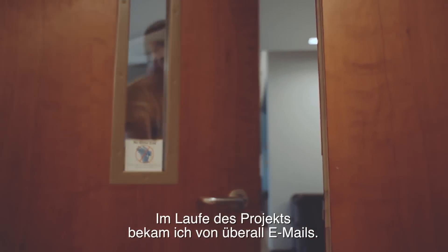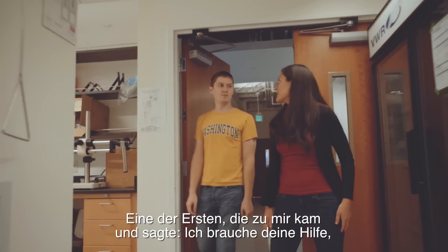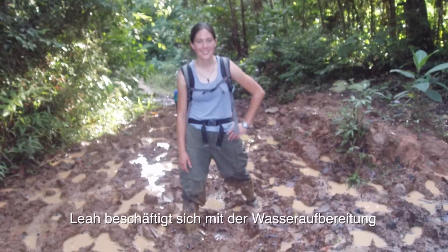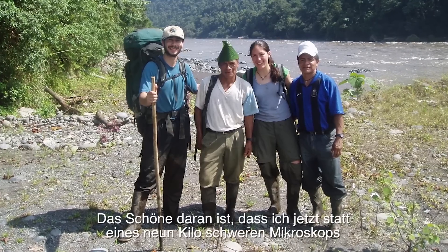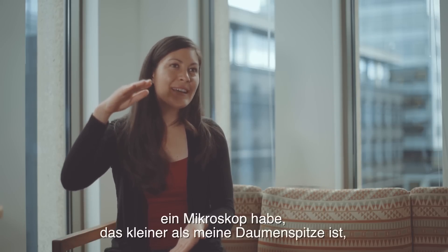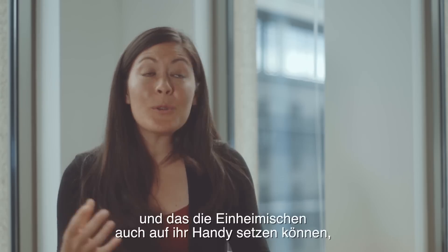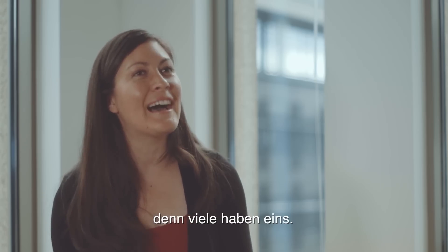As the project grew, I started getting emails from people all over the world. One of the first people who came to me was Leah Marshall. Leah works in water sanitation and actually walks around the Amazon. The beauty of it is, instead of carrying a 20-pound microscope, now I have a microscope that's smaller than the tip of my thumb that I can put on my cell phone — and local people can put on their own cell phones, which a lot of them also have.